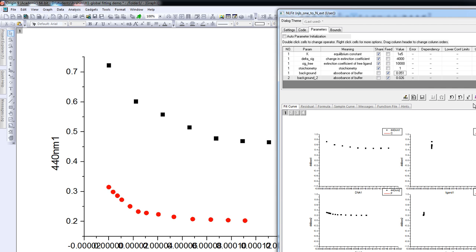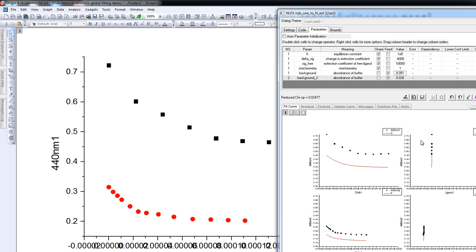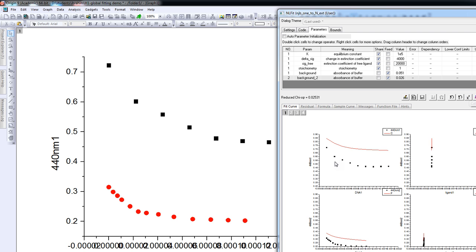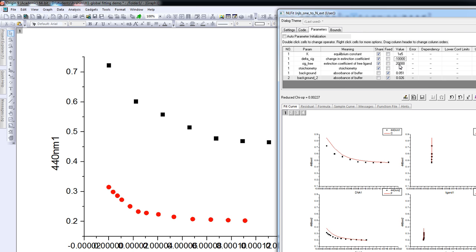We now have a look at how good the fit is already by pressing the chi-squared button. In both plots, the red line starts at about half the height of where it should start, which means we have underestimated the extinction coefficient for the free ligand. So we change that number and make it twice as big. We press chi-squared again — this is now closer. But the line doesn't come down as far as it should, so we also change the magnitude of the extinction coefficient decrease to minus 10,000. With the extinction coefficient starting at 20,000, the lines are now more or less where they need to be.